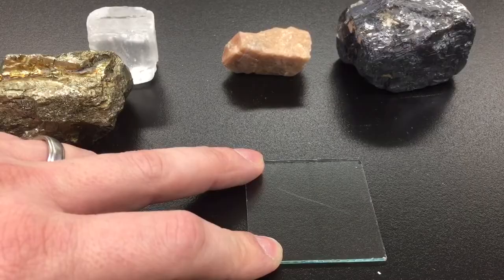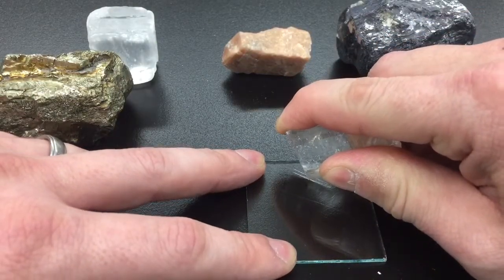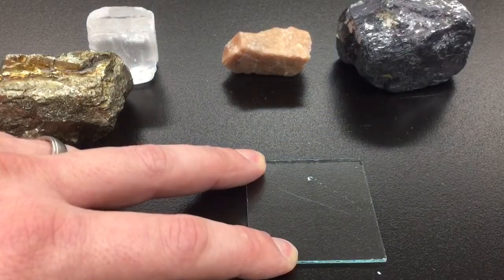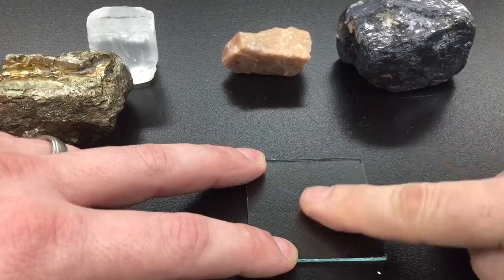We'll do this again with another sample. Press down firm — don't worry about hurting the mineral or the glass. Press down pretty firm and make a short stroke along the glass plate. Again, I'm going to try and wipe away that scratch.